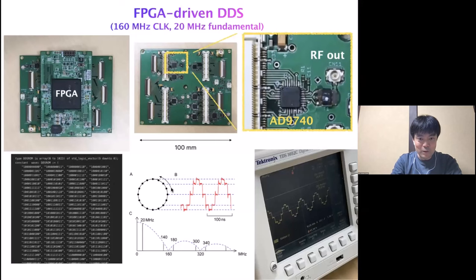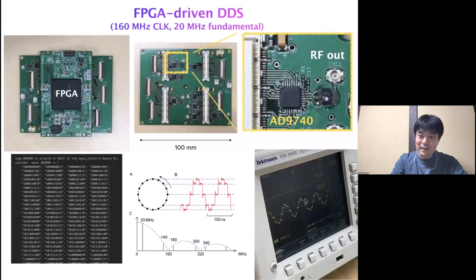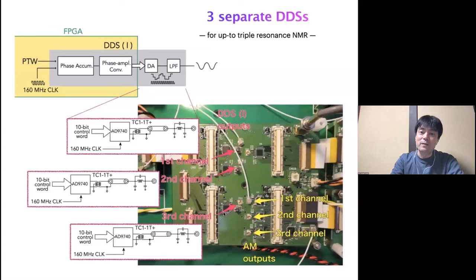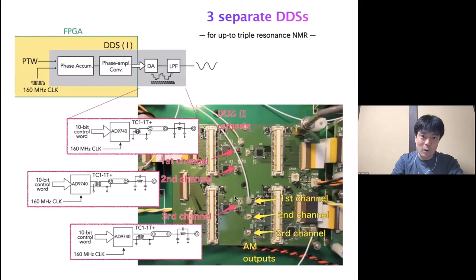When we want to change the phase of the signal, we just shift the overall phase of this wheel — it's simply a matter of shifting the address we point to in memory. In this way, we can generate a nice waveform as demonstrated on the oscilloscope display. Because we are interested in up to triple resonance experiments, we implemented three separate but identical DDS units, each with its own phase accumulator and phase-amplitude conversion table inside a single FPGA chip driven at 160 MHz, giving three separate direct-digital-synthesized waveform outputs.